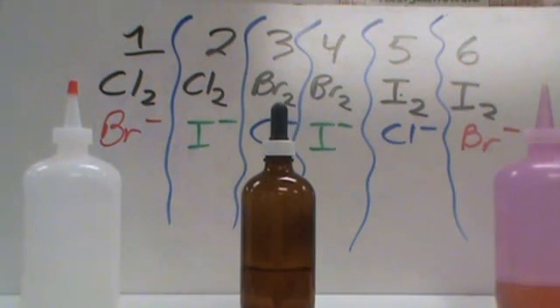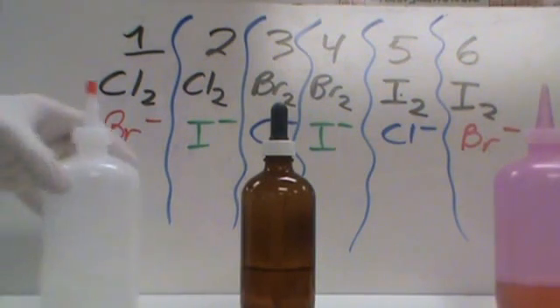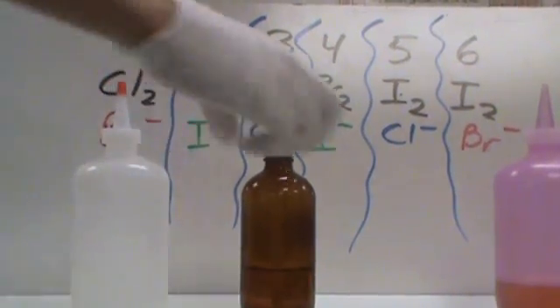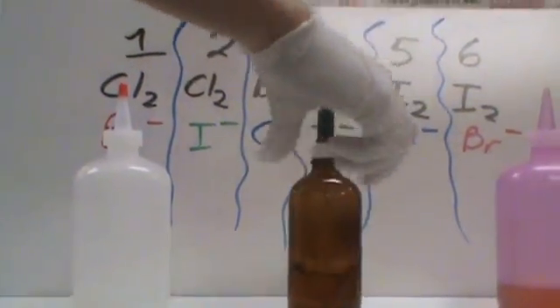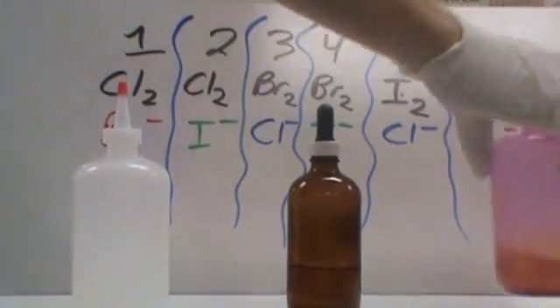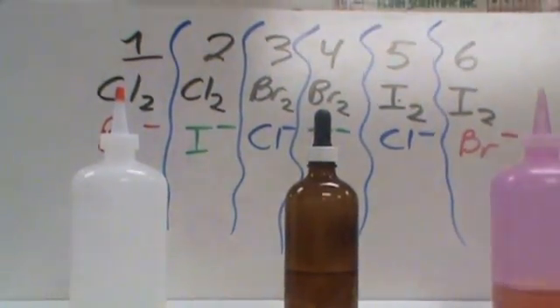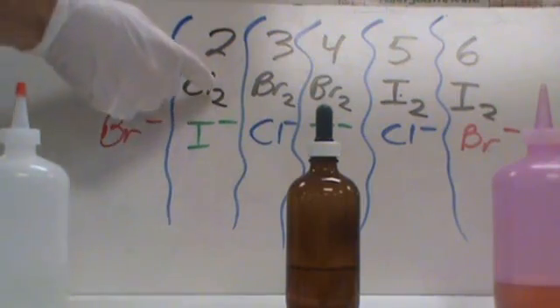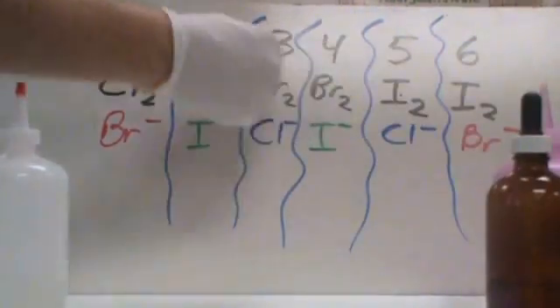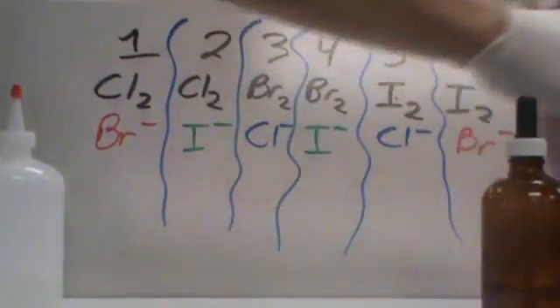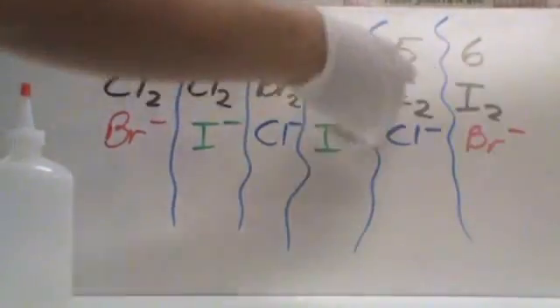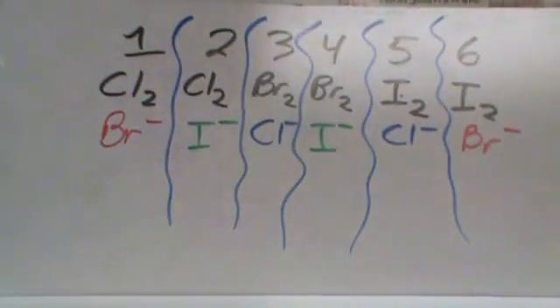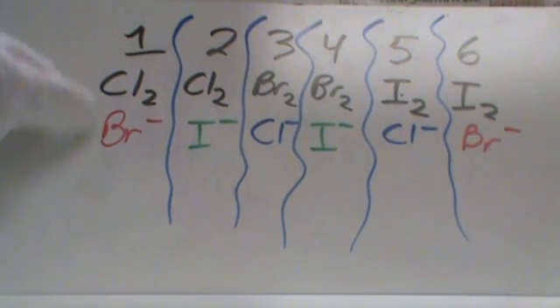So here we're going to do a demonstration with halogens. We're going to take some chlorine, which I have suspended in water, I have some bromine suspended in water, and some iodine dissolved and suspended in water. I'm going to put chlorine into the first two test tubes, bromine into the next two test tubes, and iodine into the final fifth and sixth test tubes. Then I'm going to mix a halide salt with each.